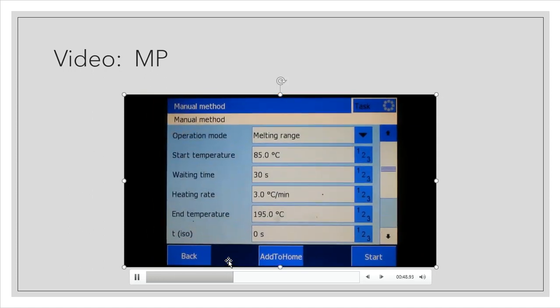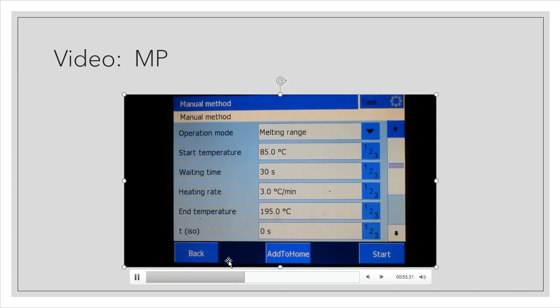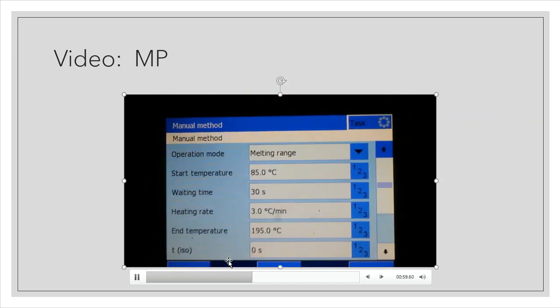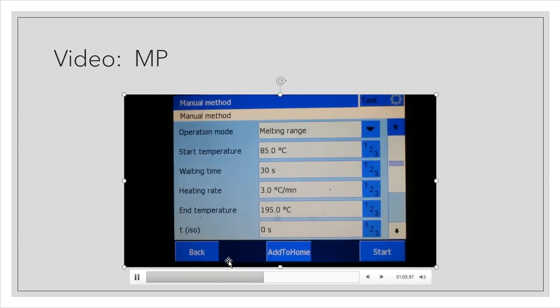Then the waiting time is how long this thing is going to start at that temperature before it actually begins to heat up. 30 seconds is the default. The heating rate, I'm going to keep it at 3 degrees. It's going to be quite a large range, but I want to get a really good melting point, so I need to slow this down.